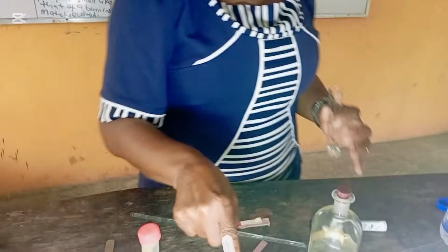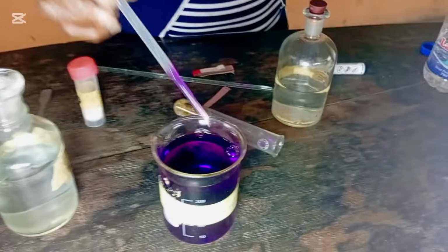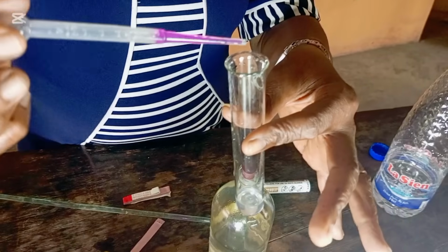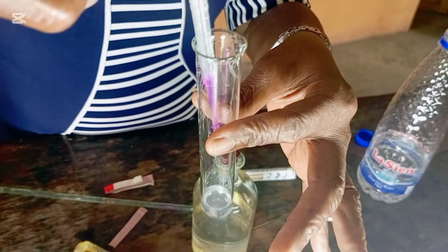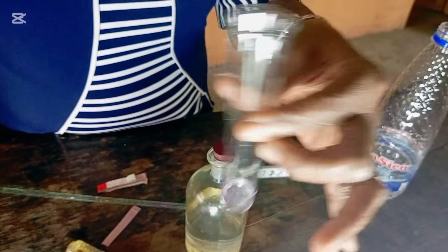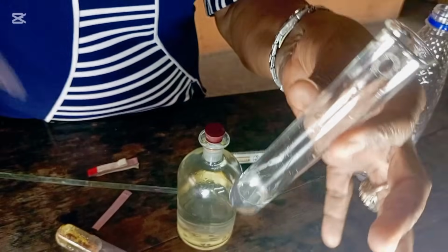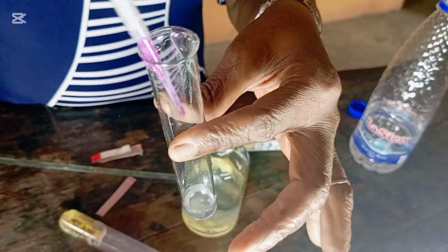Okay. So that's the KMnO4. You can see it's purple in color. You are asked to add few drops of this KMnO4 to the second portion of your D. You now add. You can see you are adding. The color is being decolorized. Can you see? You are adding. The color is being what?